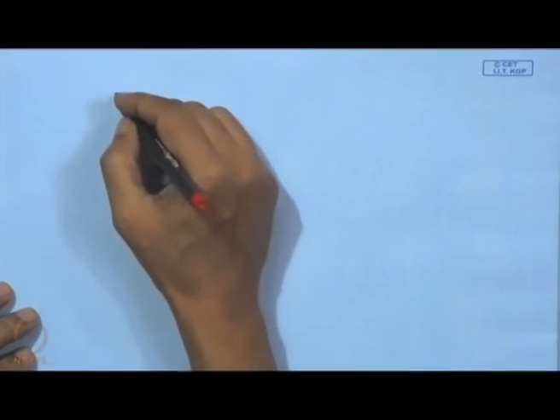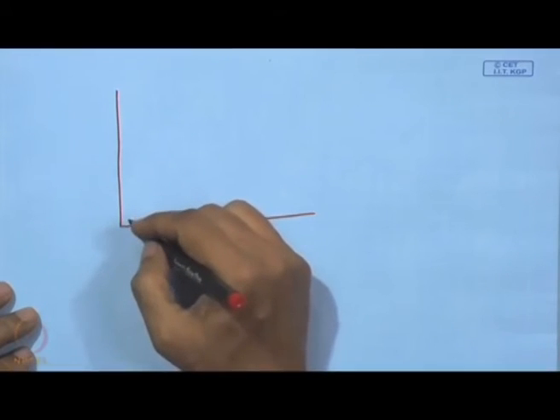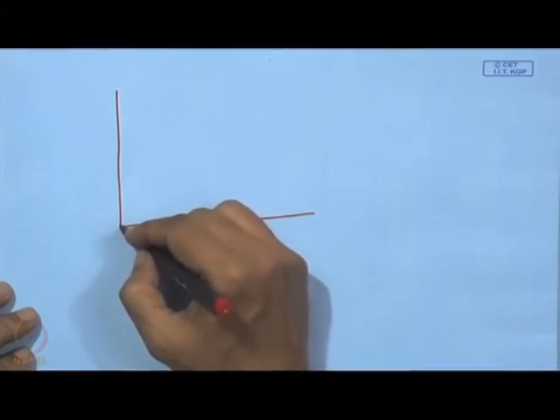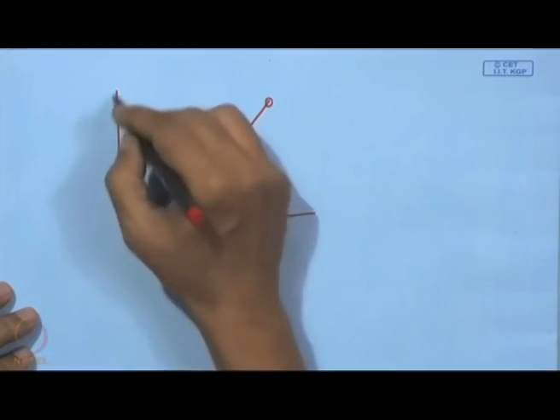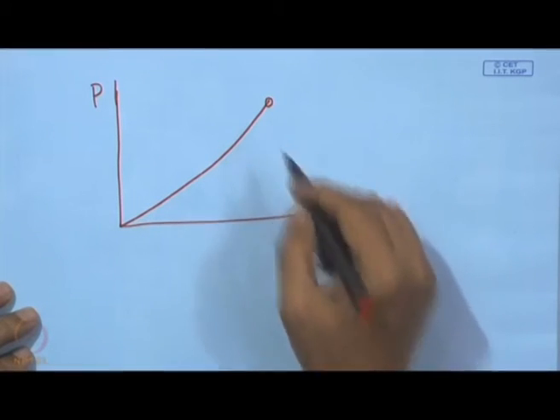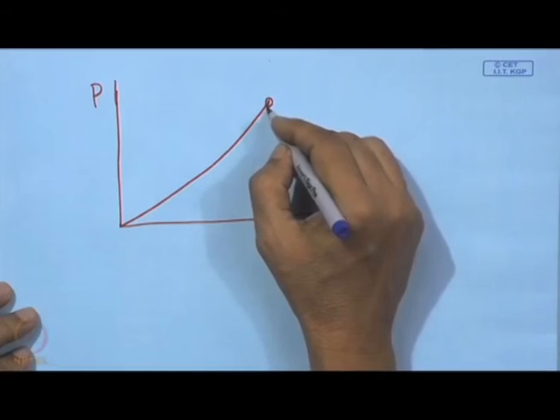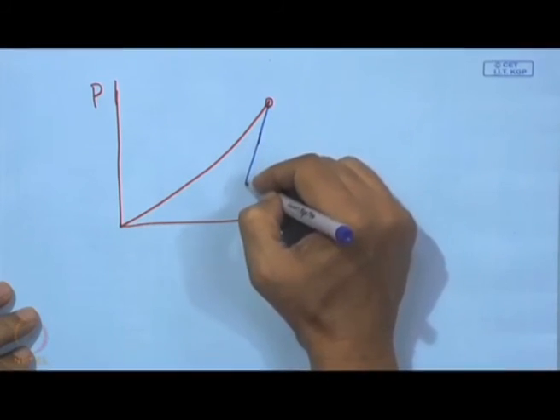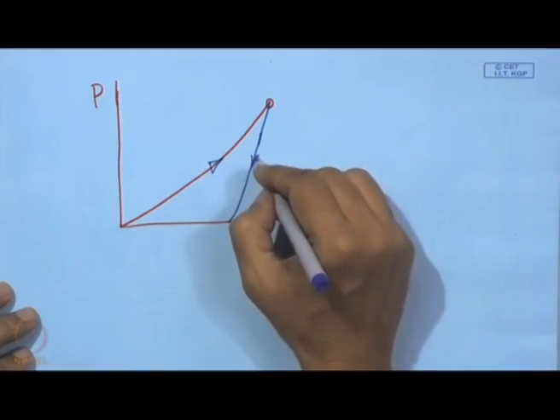So, what we can see here is the loading, this is the load, it is elastic, and then when the load is released, it comes back like that, and that is going to be the recovery.